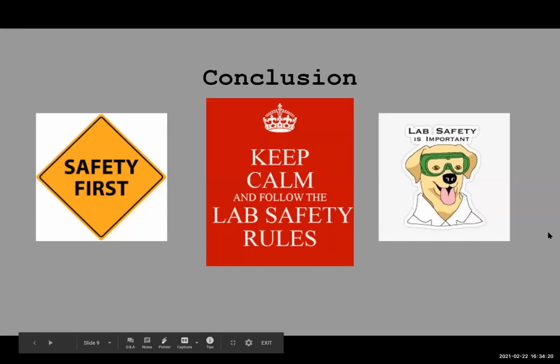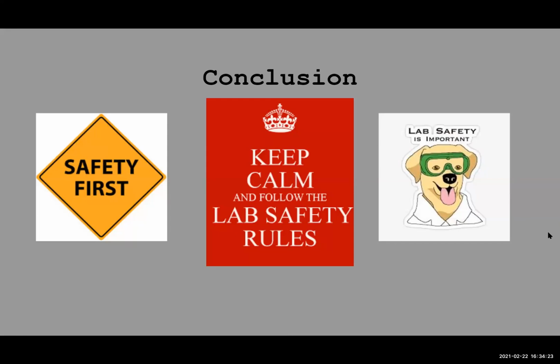In short, it is important to remember to prioritize and uphold safety, as well as to recognize proper safety measures in the lab to not pose any danger to ourselves or other people in the vicinity.